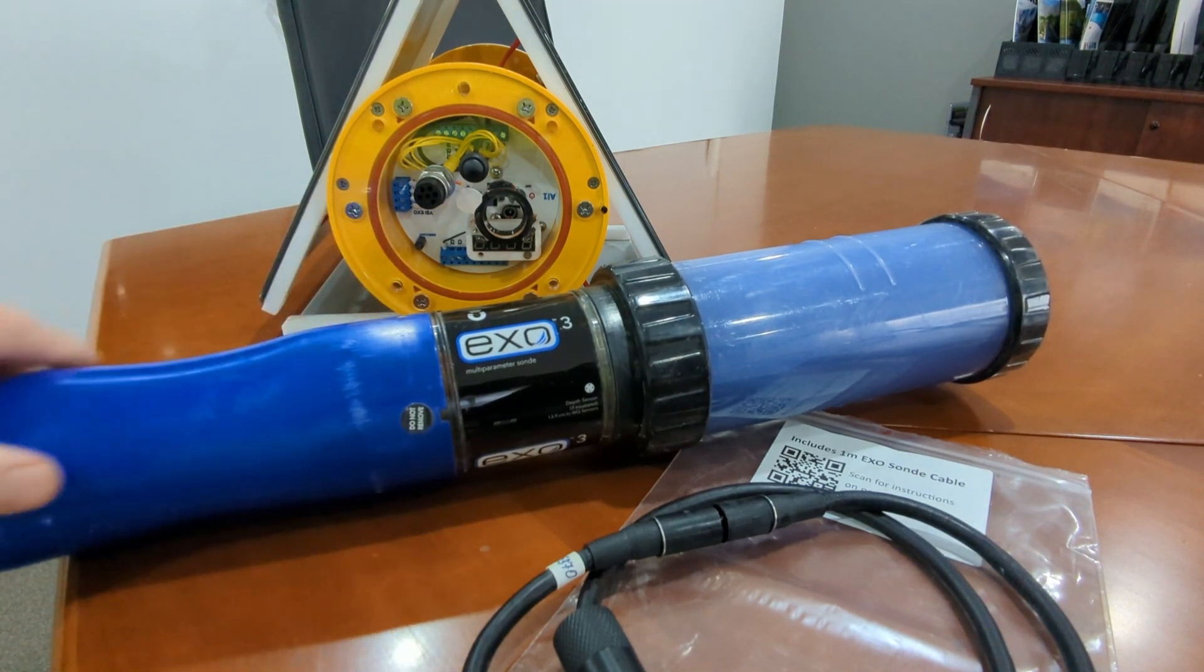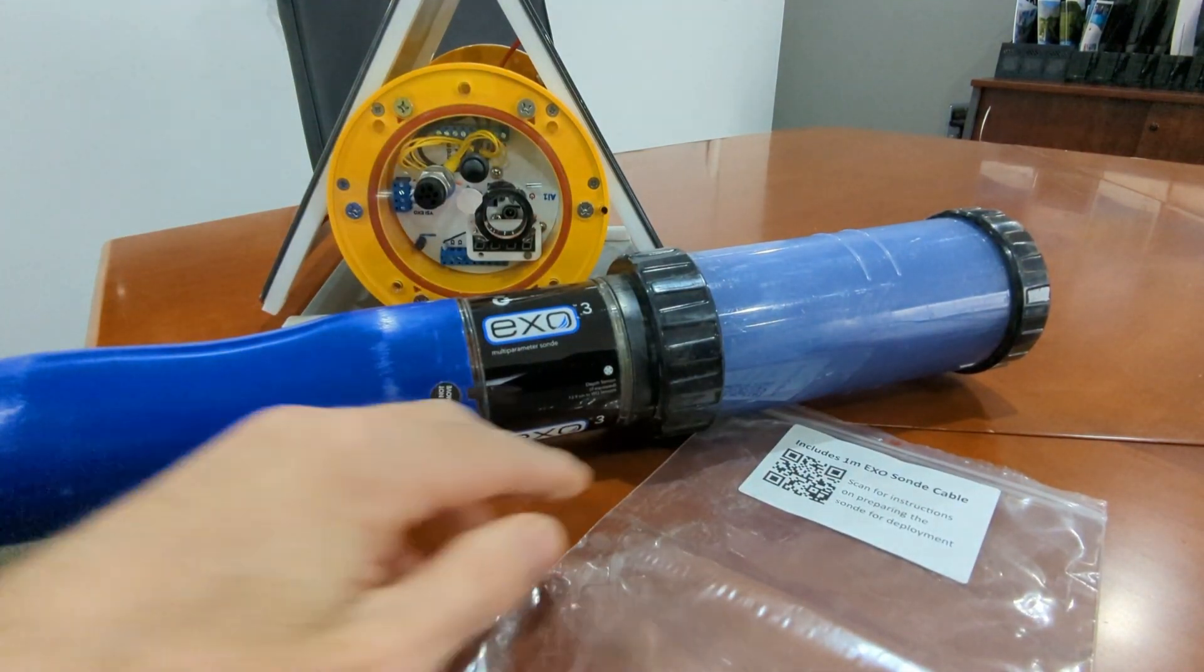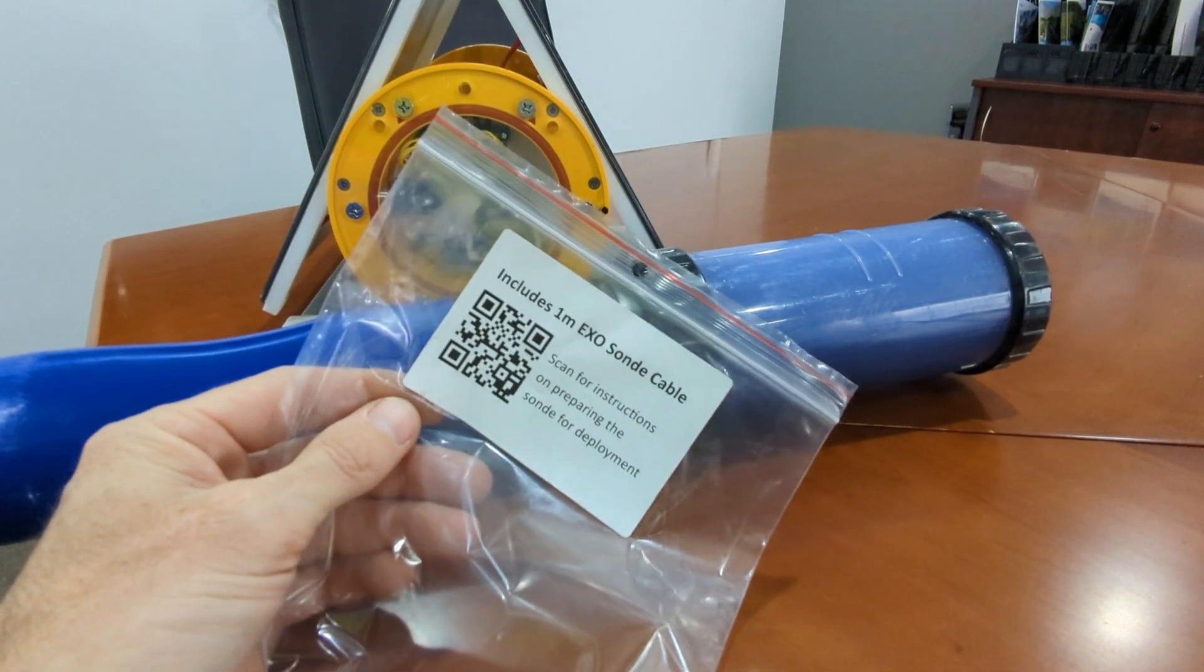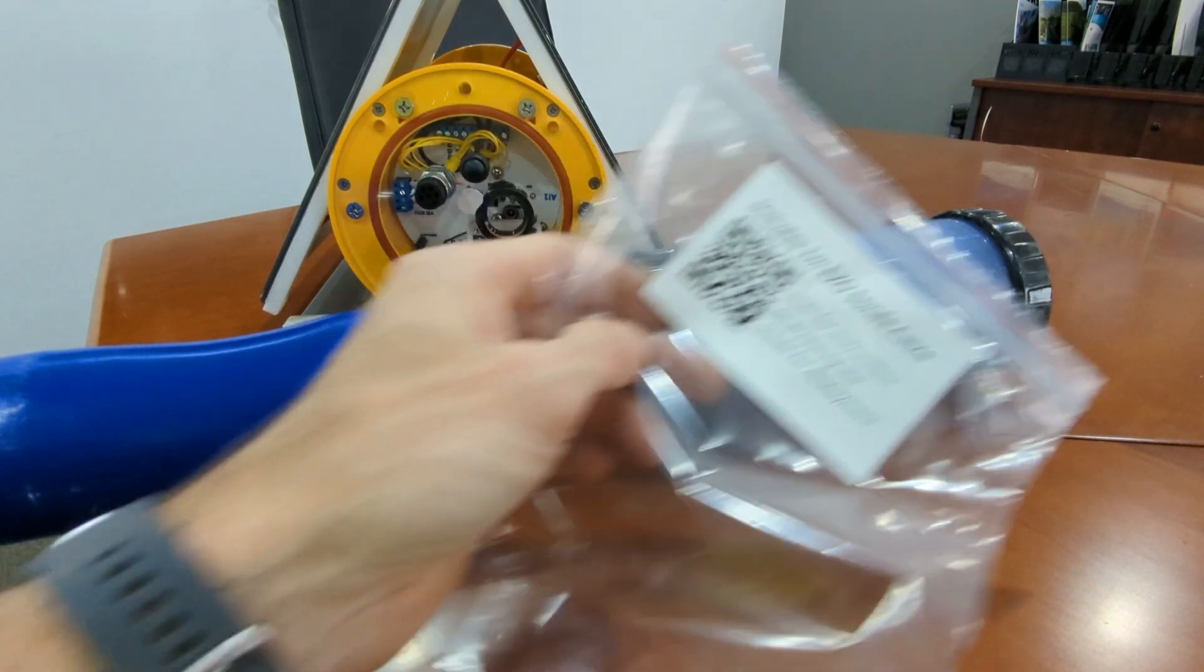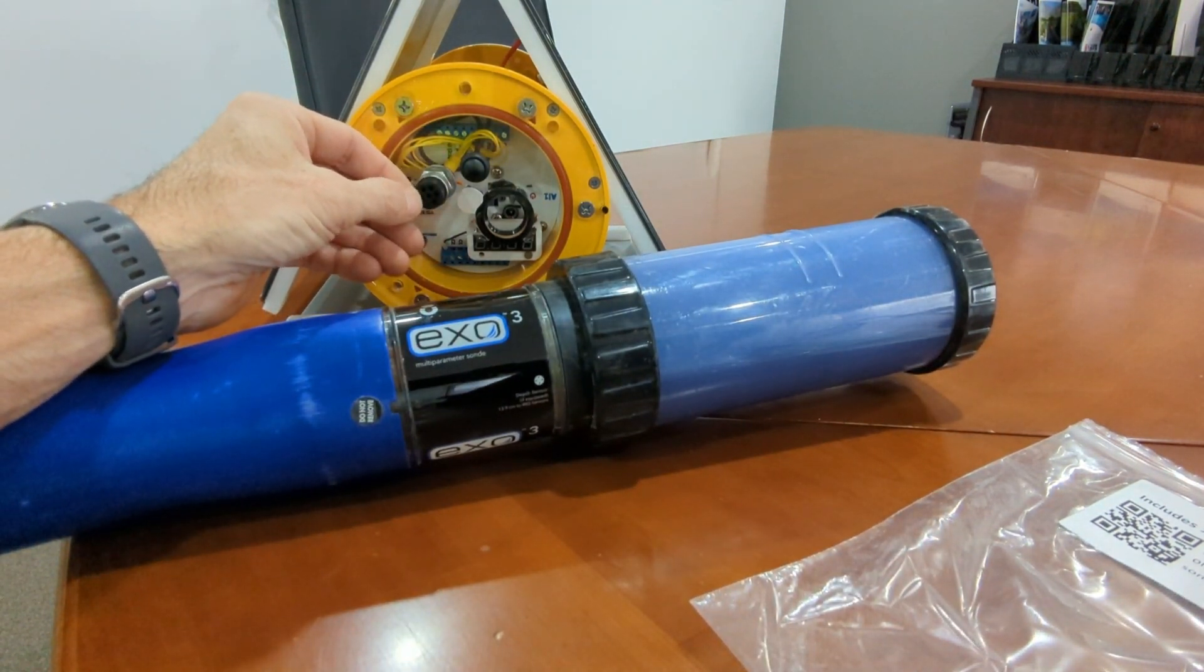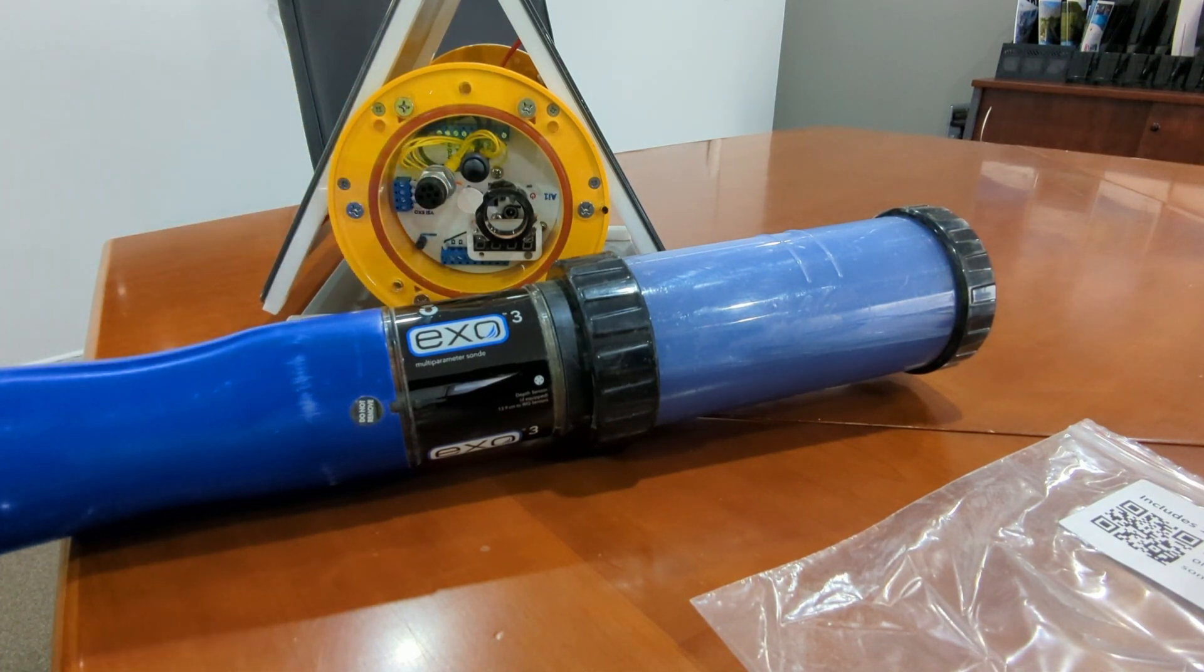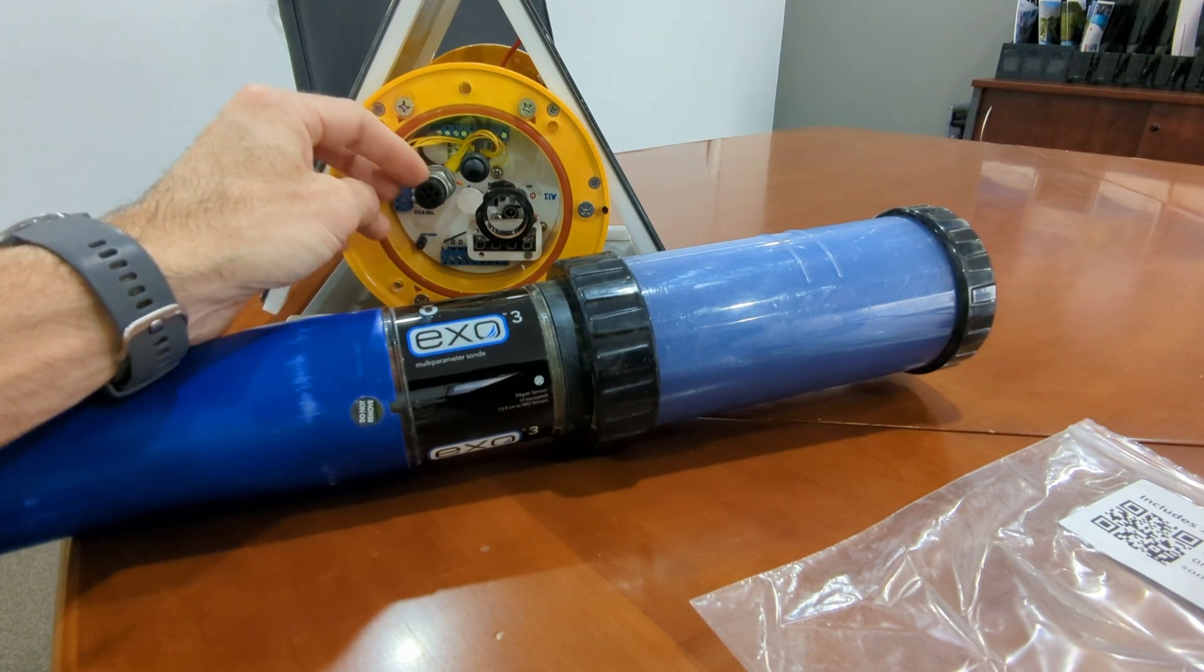To prepare the hardware for use mainly involves lubricating the connectors. As with many parts in the AI-1 shipping kit, you have a QR code on the packaging that you can scan to get instructions. You look at the connector and check for any debris inside, making sure they're nice and clean. If you find debris, use compressed air to blow it out.